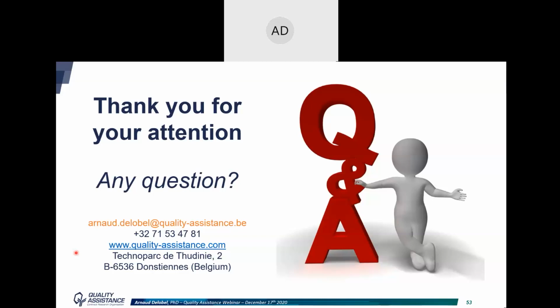Thank you. Next question. Do you have an approach to compare icIEF and IEX results, as they are considered orthogonal? Do you have a strategy to find the same components?